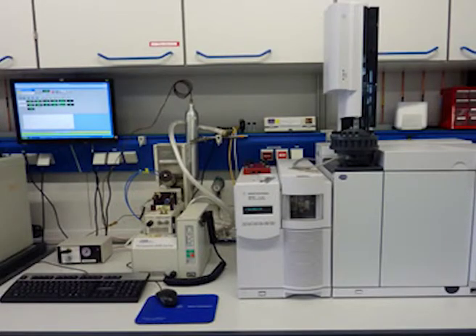Coming to pyrolysis gas chromatography. This is a destructive method of chemical analysis in which the question paint sample is heated to decomposition into smaller molecules, which are then separated by gas chromatography and detected using mass spectrometry. Here, pyrolysis means thermal decomposition of materials in inert gases or vacuum. The sample is put in direct contact with either a platinum wire or placed in a quartz tube and heated rapidly at 600 degrees centigrade to 1000 degrees centigrade.